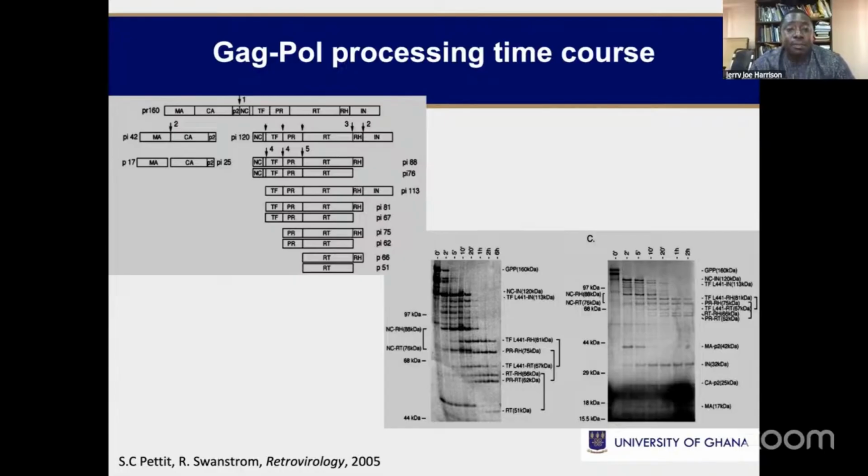What it means is that the protease in the Gag-Pol has to be active, and then the protease in the other polyprotein intermediate has to be active. But it was also found that the initial cleavage happens between the p2 and nucleocapsid junction, or the nucleocapsid and transframe domain junction, thereabout. But the take-home message is that irrespective of where the initial cleavage happens, it's likely intramolecular, and the released polyprotein retains activity for the protease. And these gels show that beautifully.